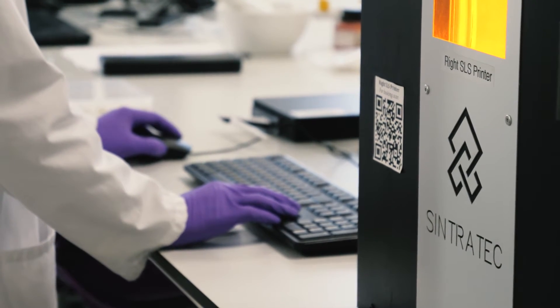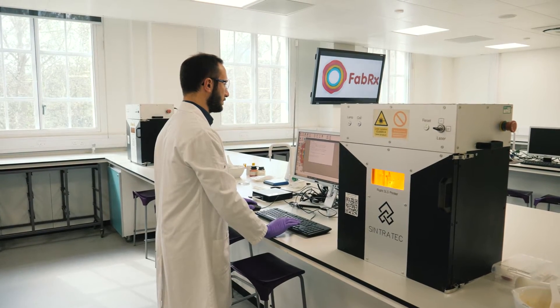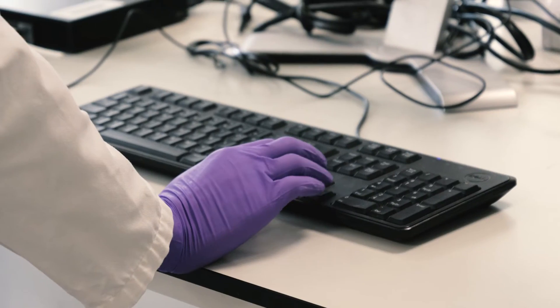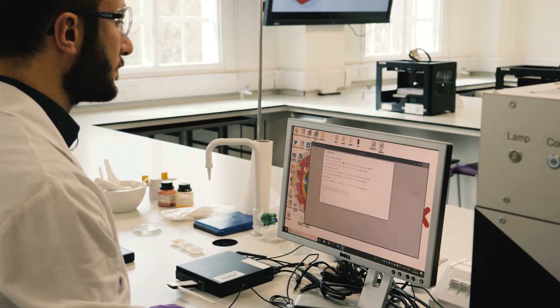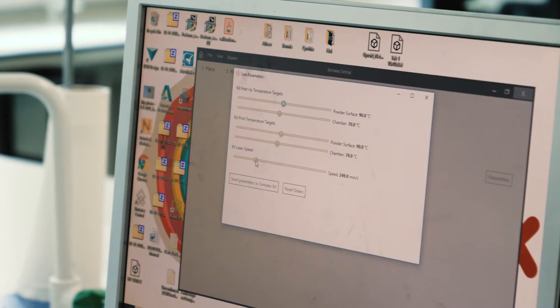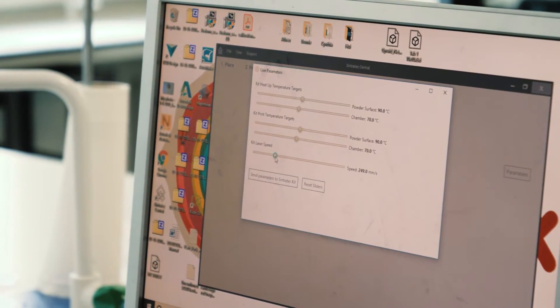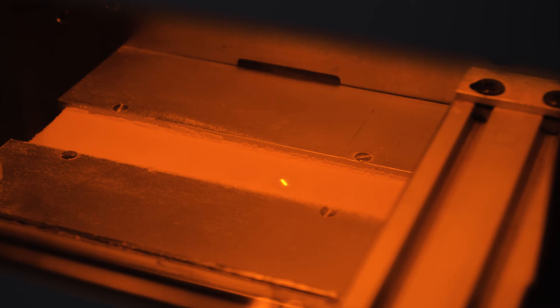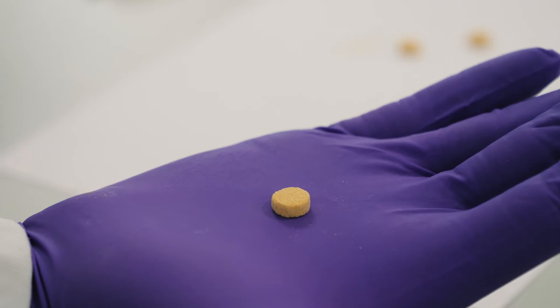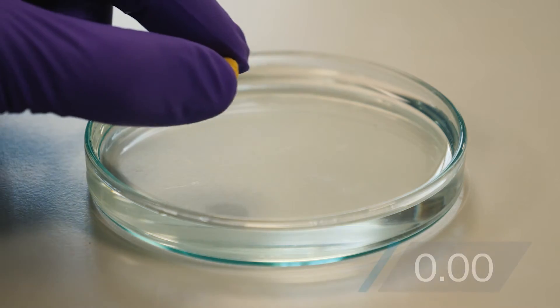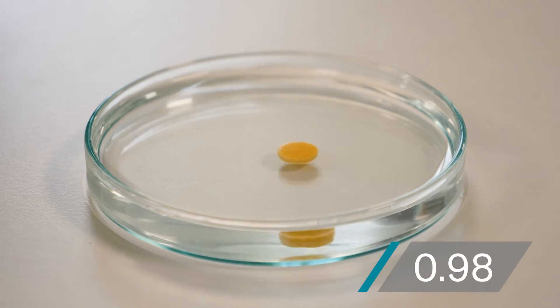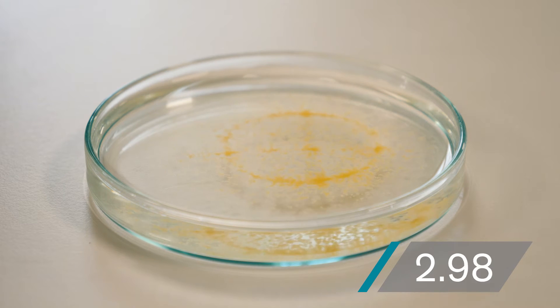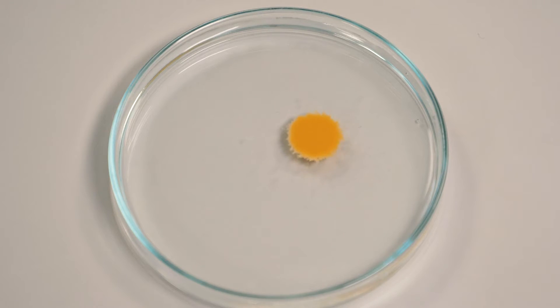The big advantage of the Sintratec kit is we can customize the printing parameters, we can choose the ideal temperature and the ideal laser speed. We can start from one millimeter per second up to 1000 millimeter per second and in that big range we can actually make very different products with different strands which dissolve at different times just by changing the laser speed.